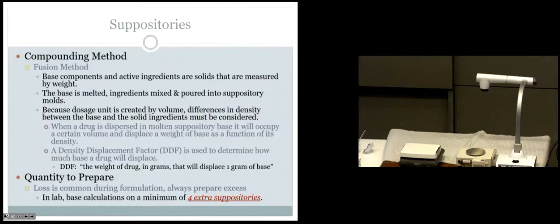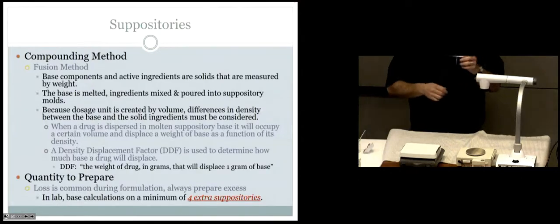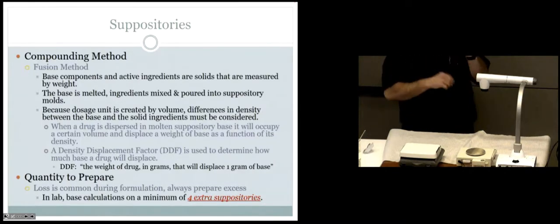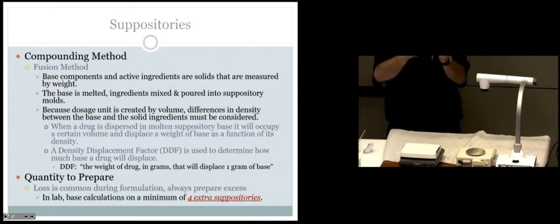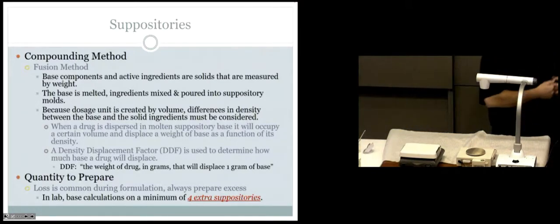Okay, we're going to use a mold to do that. All right. So, the compounding is very easy. The calculations are hard. That's the disadvantage to using the fusion method, because you need to understand this. This is the disposable mold. You'll be using an aluminum mold. But either way, when you pour into a mold, would you agree this mold has a fixed volume? It has a certain volume of liquid that you can pour into here. So you are going to be compounding by volume.